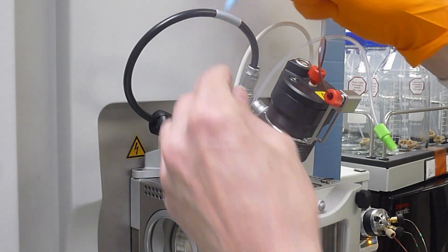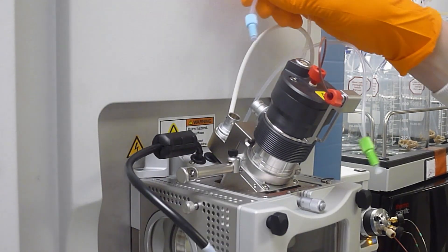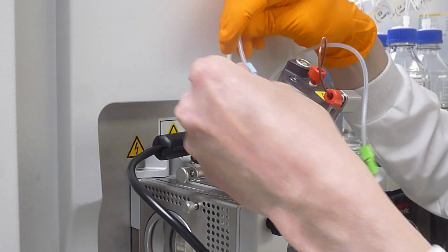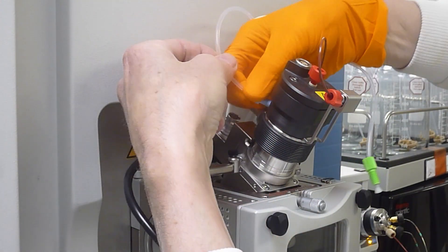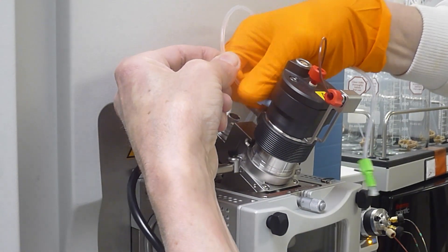Next you can fit the two gas tubes. You might want to move the heater cable out of the way first. Fit the blue tube and the green, trying not to get them cross-threaded.